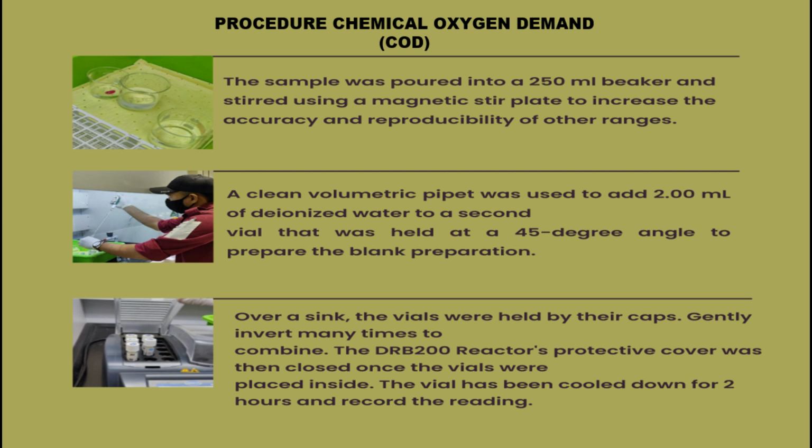Lastly, over a sink, the vials were held by the caps and gently inverted many times to combine. The DRB200 reactor protective cover was then closed once the vials were placed inside. The vials were cooled down for 2 hours and the reading was recorded.